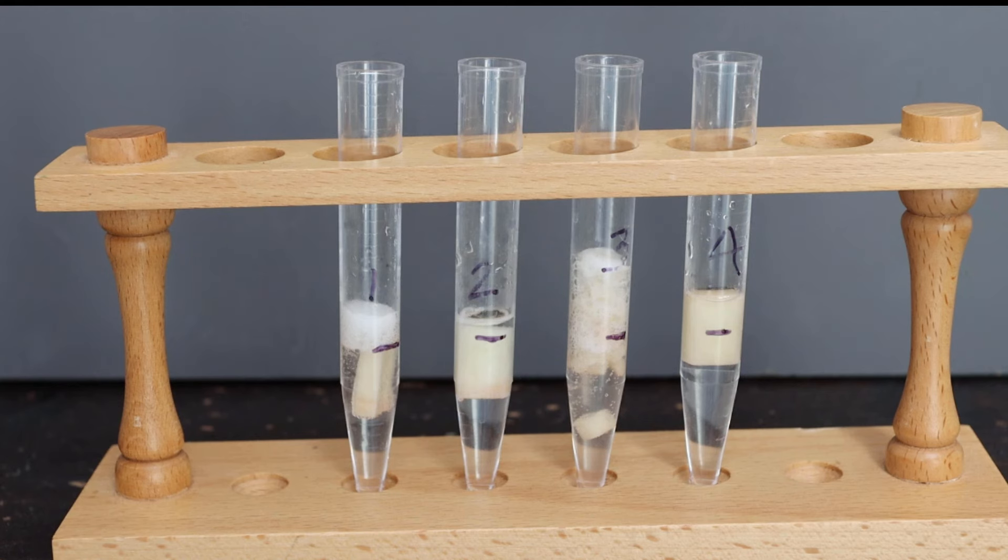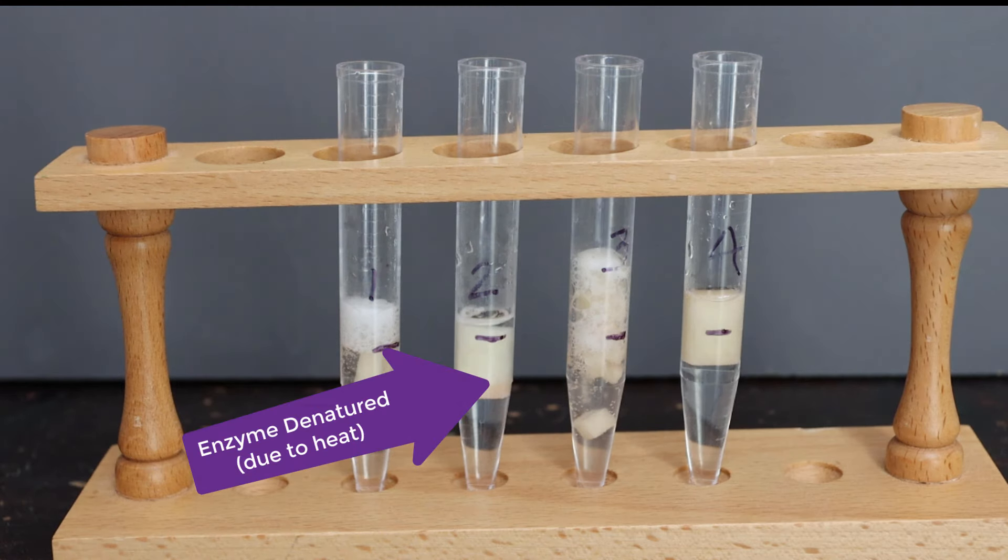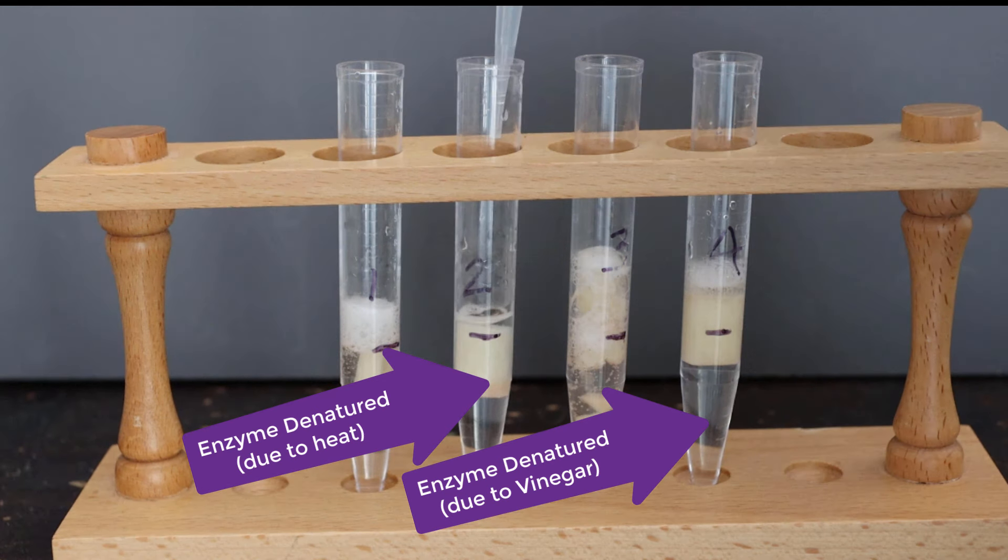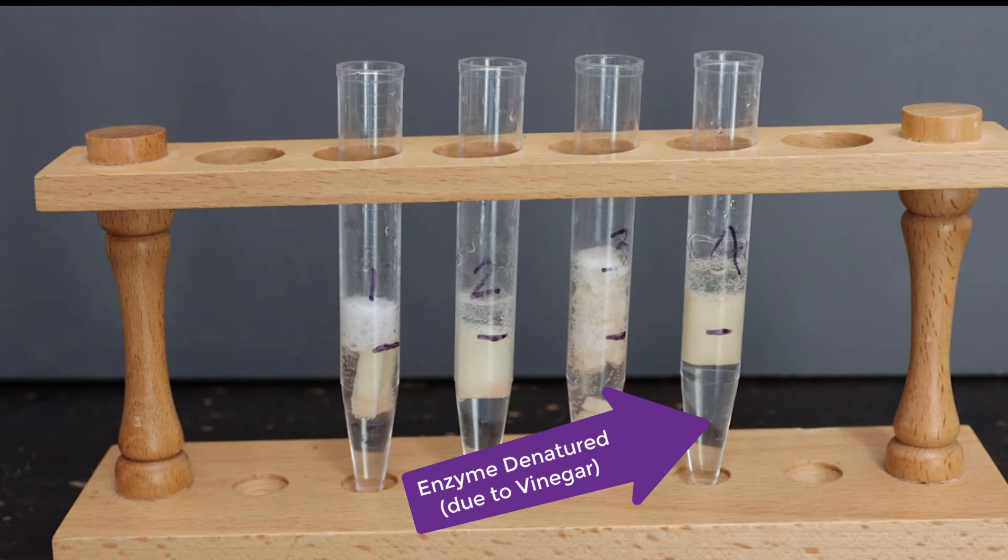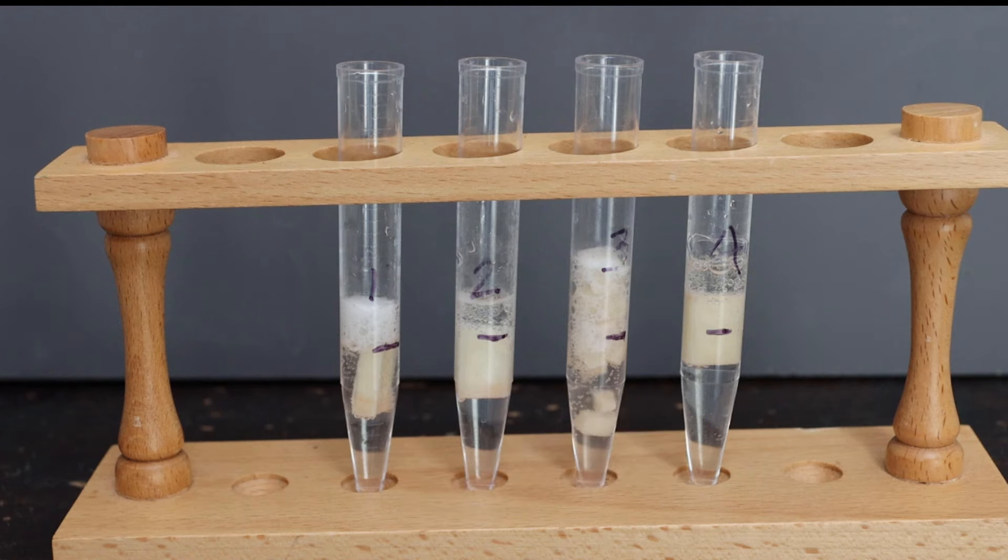So again, test tube one and test tube three give you the best results. By far, test tube three works the best. Test tube two, the enzyme's been denatured by heat, and in test tube four we've also denatured the enzyme, but chemically by adding acetic acid. So that is the catalase experiment summary.